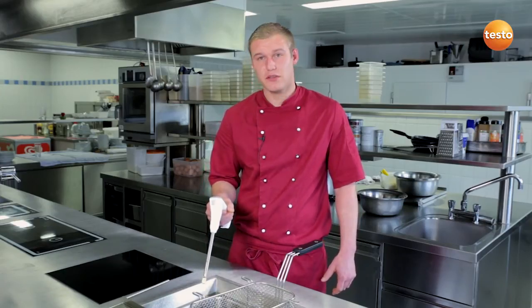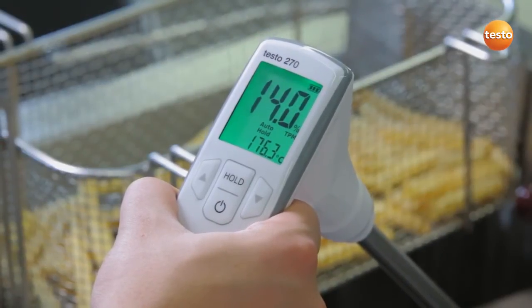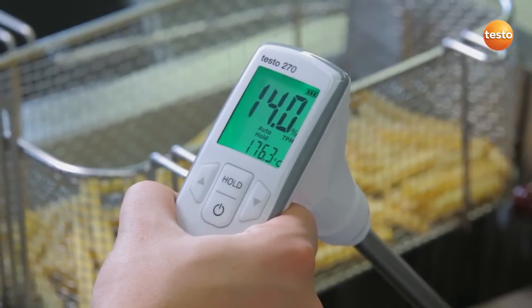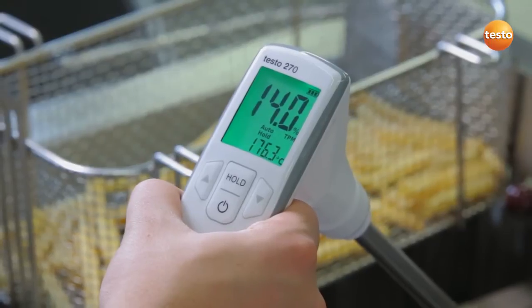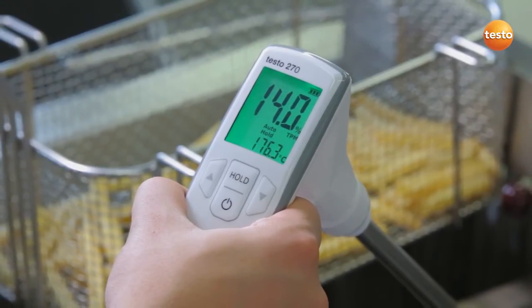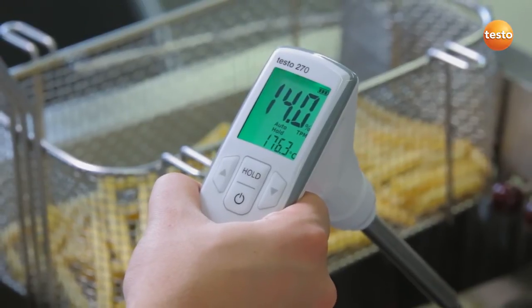That's it. Careful, the probe is very hot — please don't touch it. The measurement results appear in the display. The smaller value shows the temperature of the cooking oil. The larger value, and the more important one, is the TPM value. This gives the polar components in the oil, which are a sure indicator for the quality of the cooking oil.